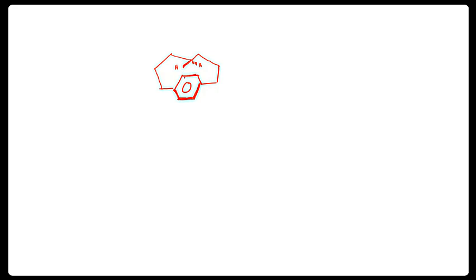These two protons are just above the pi system.